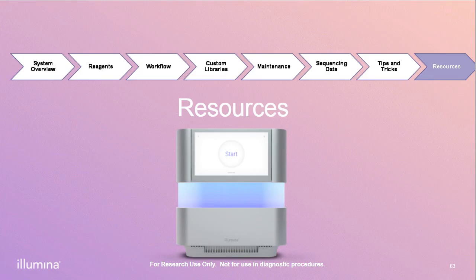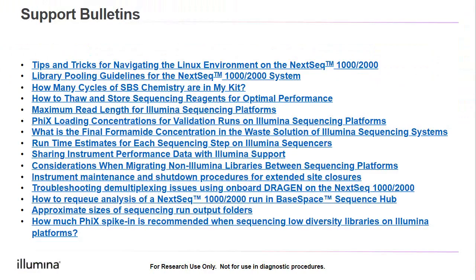Now that we've gone over the wealth of information, I'm going to talk a little bit about our resources. Here I have linked to all of the pertinent bulletins we have available for the NextSeq 2000, including all of the tips and tricks that I went over in today's presentation. They're available in the top bulletin linked here.